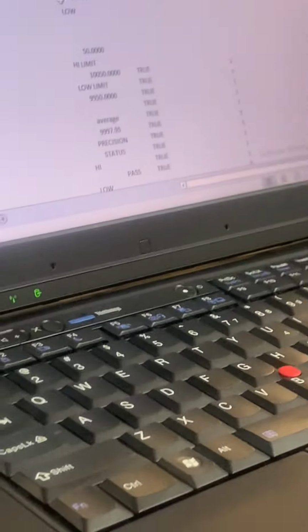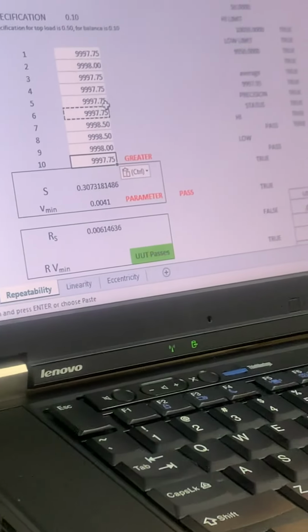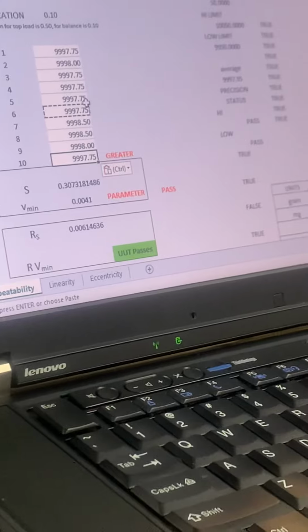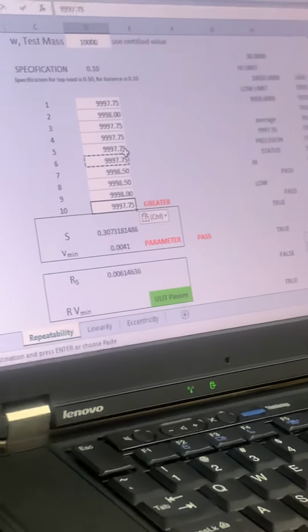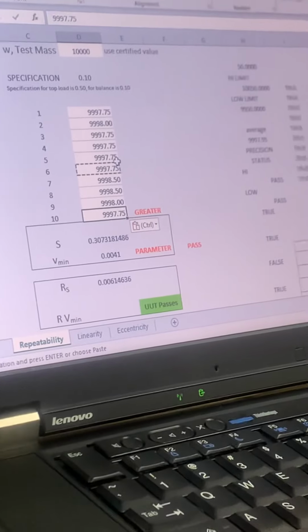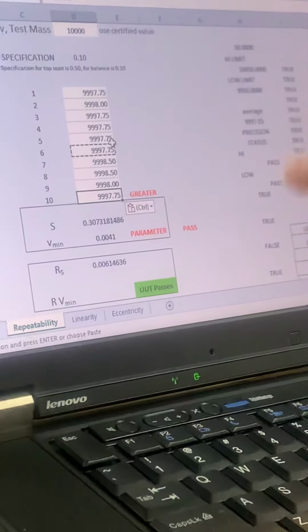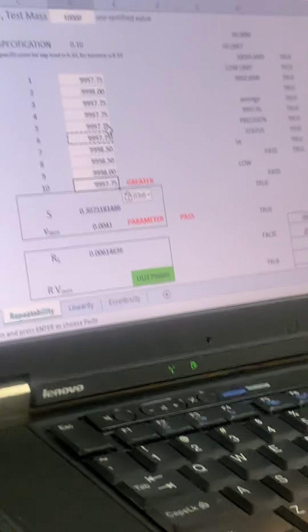So it looks like this on Met Team. This is just for the data. So we actually don't even really have this in Met Team on any of the templates. Whenever you do this, if the scale is in Met Team, like you go out to a client that's in Met Team, then you can put this in the notes section in Met Team. But if you're doing it on paper, you need to write it on the cert.